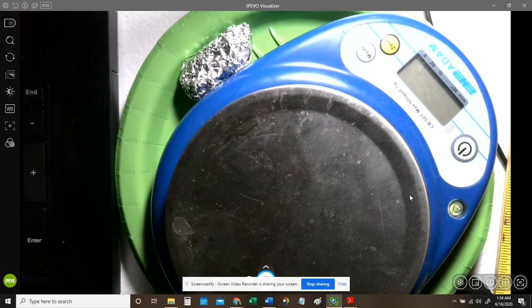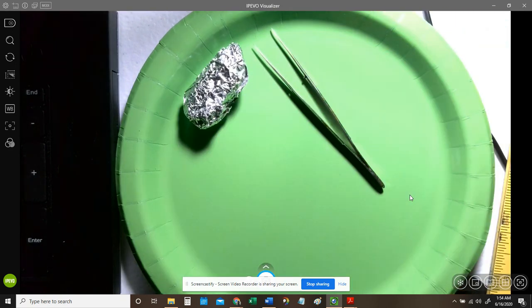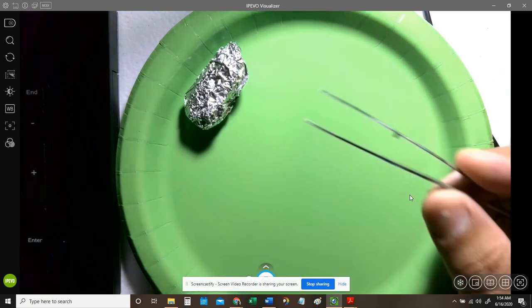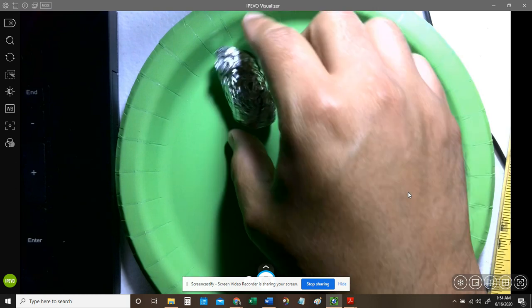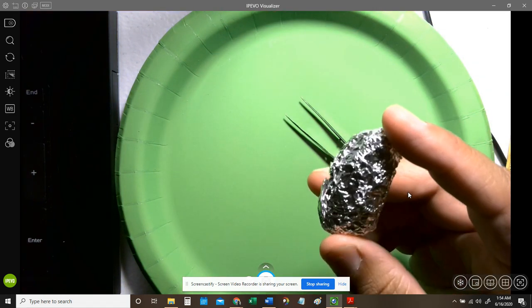Okay. And then some of the resources you're going to need are pretty simple. So you will need an electronic balance. You will also need, of course, some sort of a paper plate or dissection tray. Forceps are usually pretty good. And then, of course, your owl pellet. And you can see your owl pellet is not very heavy. It's not big.